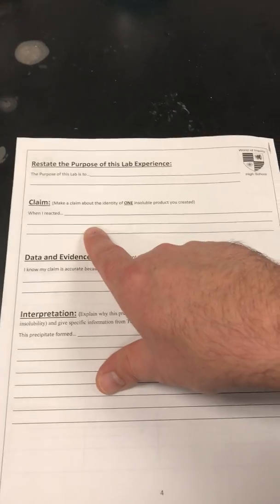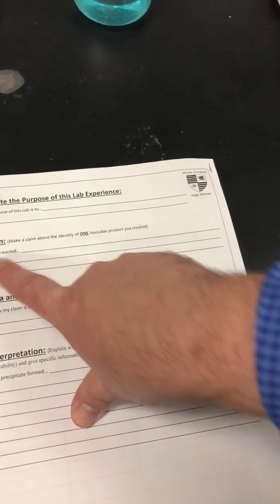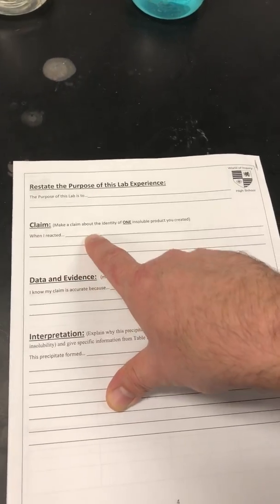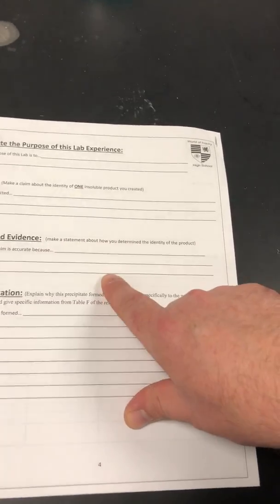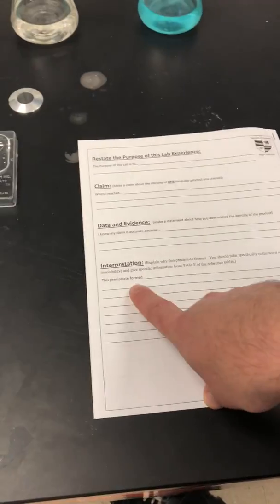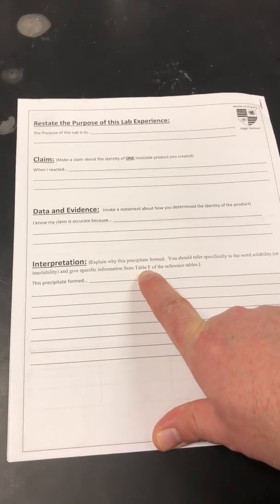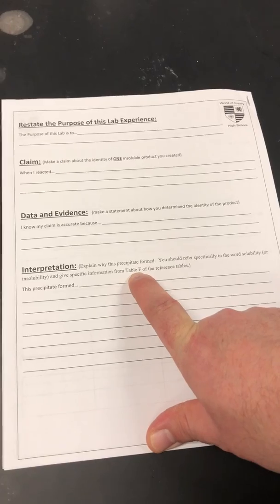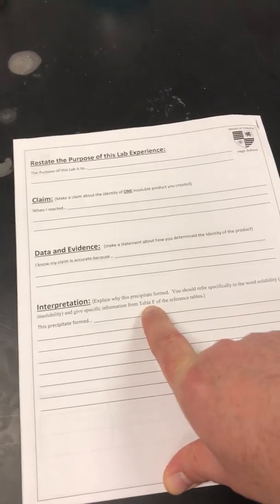Restate the purpose. Claim: pick one that made a precipitate. When I reacted this chemical with this chemical, I created this and this. This particular one was the precipitate. I know it was accurate because, what did you see in the well plate? And then your interpretation needs the word solubility or insolubility, and use evidence from Table F. So all hydroxides are insoluble except when they're with group 1 ions. My hydroxide was not with a group 1 ion, therefore it was insoluble. Some kind of a statement like that.